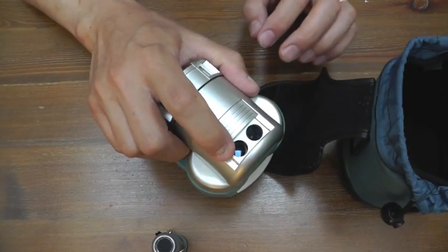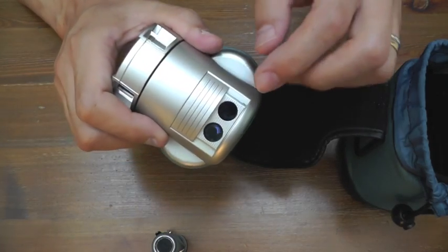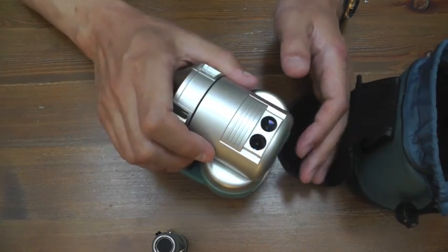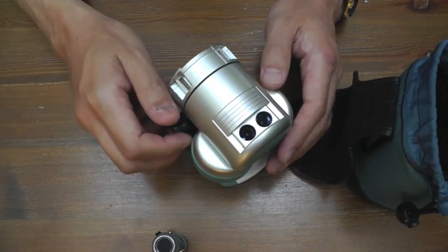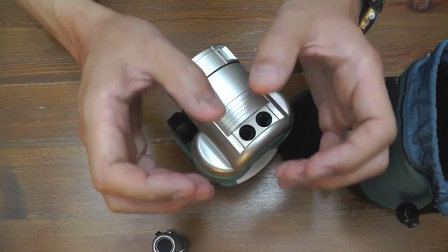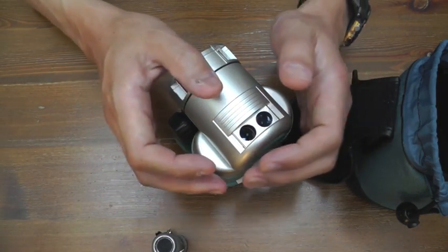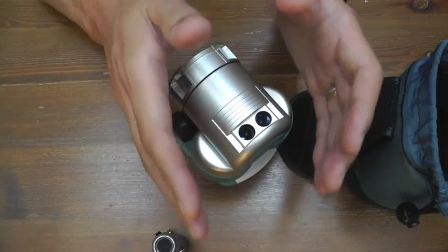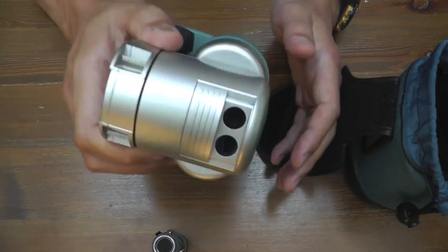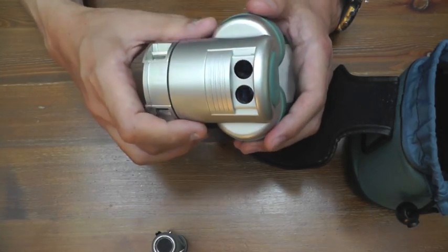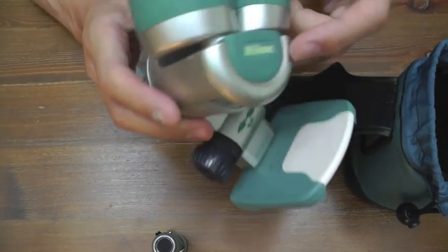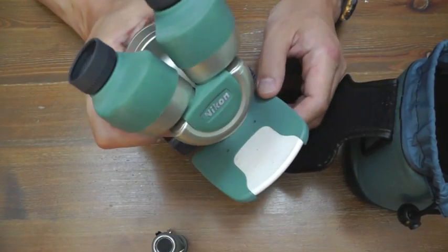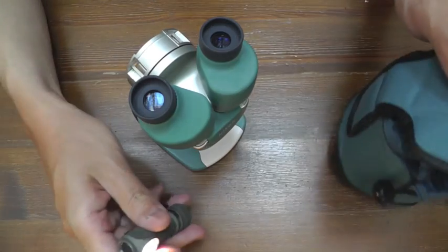And it also has two objective lenses, so we can observe things to our eyes. I mean, we can observe three-dimensionally. Yes, it's a real binocular microscope. And Nikon optical performance is superb. So I use this one like this.